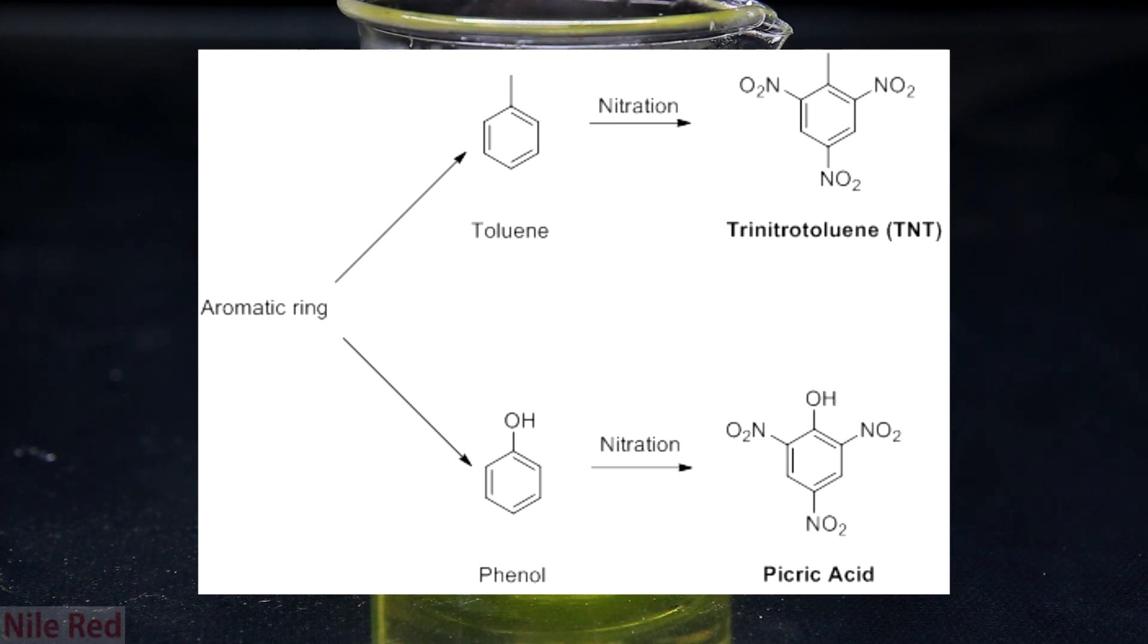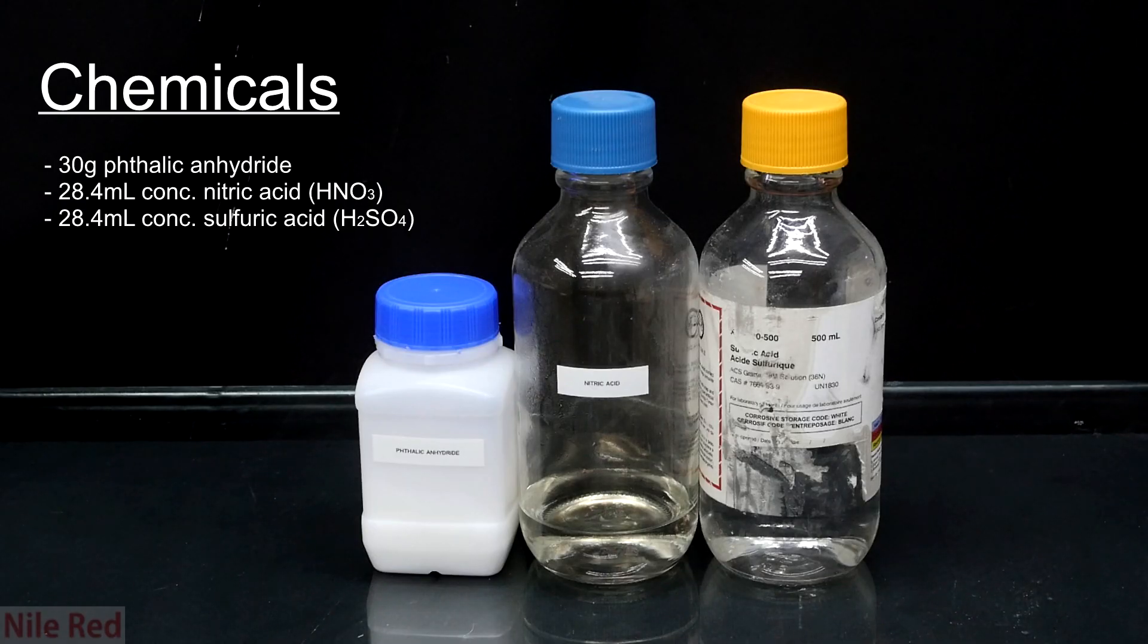Anyway, with no more stalling, we can go over what we need to do this reaction. For this reaction, I used 30 grams of phthalic anhydride and 28.4 milliliters of both concentrated sulfuric acid and concentrated nitric acid. The nitric acid was made by myself at home, the sulfuric acid was distilled from drain cleaner, and the phthalic anhydride was actually purchased.